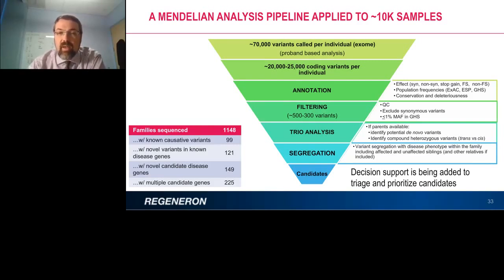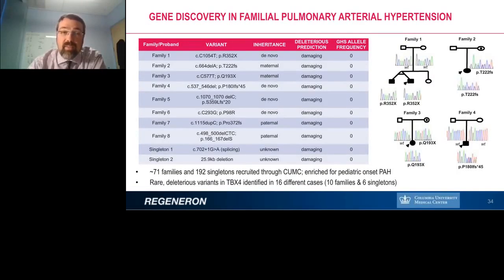This is a methodology that a variety of people have applied. This is not new with us, although I think we do it quite well. And with that theme of automation and collaboration, we've had a lot of the informatics teams working closely with the Mendelian disease teams to build out a lot of automation. And hopefully soon we'll be doing this on a decision support basis, really having the analytical pipelines be completely automated, and then the Mendelian disease expert doesn't spend a lot of time digging in on the munging of the data, but spends their time looking at things like this.